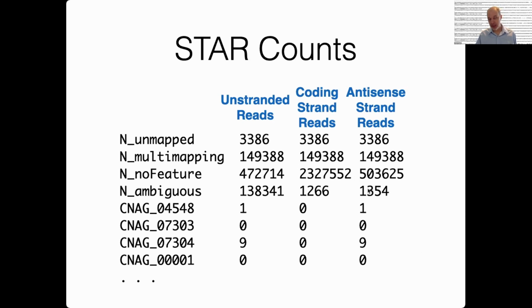Most of the time, with strand specific libraries, you want to look at this column because it gives you the reverse complement of the RNA as it was in the cell. But you actually have to know how the library was prepared to know which column to use. And if you don't know that, there are ways to guess. There's software that can give you some idea.